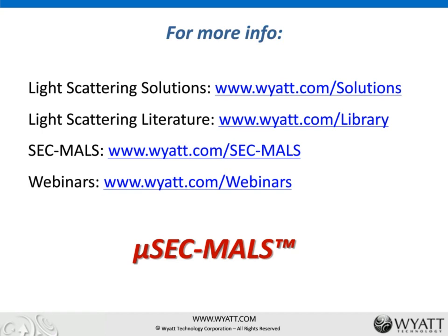Actually, a lot of those specifications can be found on our website, product, MALS, and microDAWN. And can you actually use the system to calculate radius of gyration? Yes. It has 3 different angles at 45, 90, and 135. So it can measure the radius of gyration from 10 to 50 nanometer. Okay. And we have another question asking how many detectors and at which angles? 3 at 45, 90, and 135. Okay. All right.